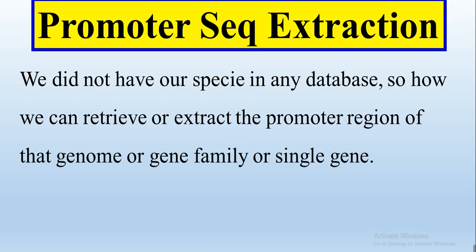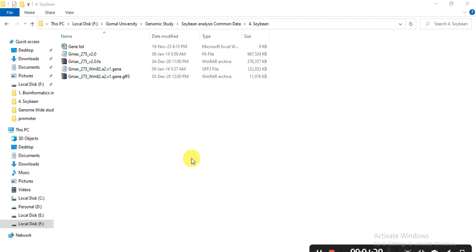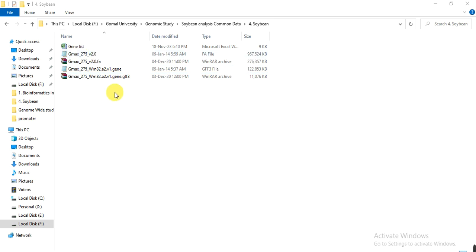From the GFF file and genome file we can extract the promoter region of the whole genome, make a specific file for the promoter region of each gene present in that species genome, and then extract the promoter region of our studied genes or gene family. For example, I am working on a plant species — Glycine max — and I have a genomic file and a GFF file. Using these two files I will make the promoter file of the whole genome.